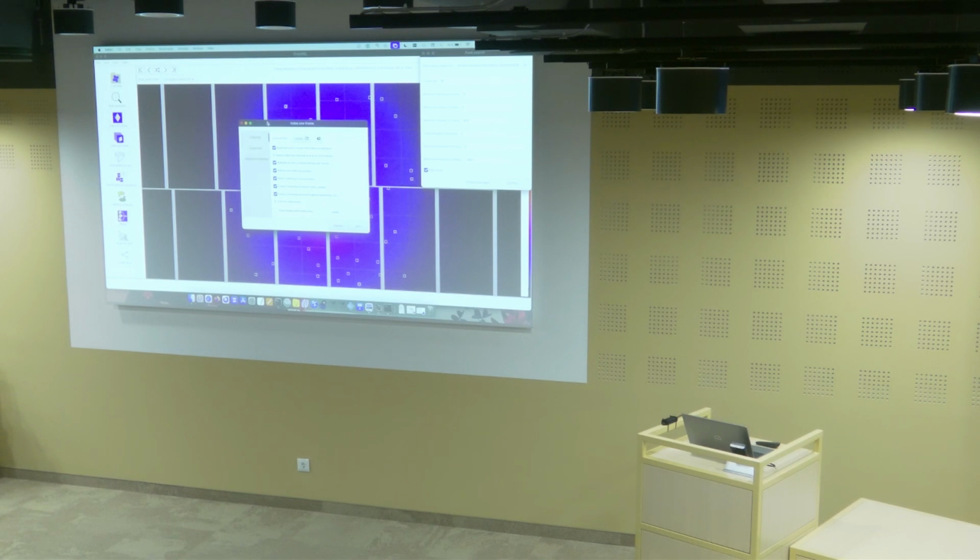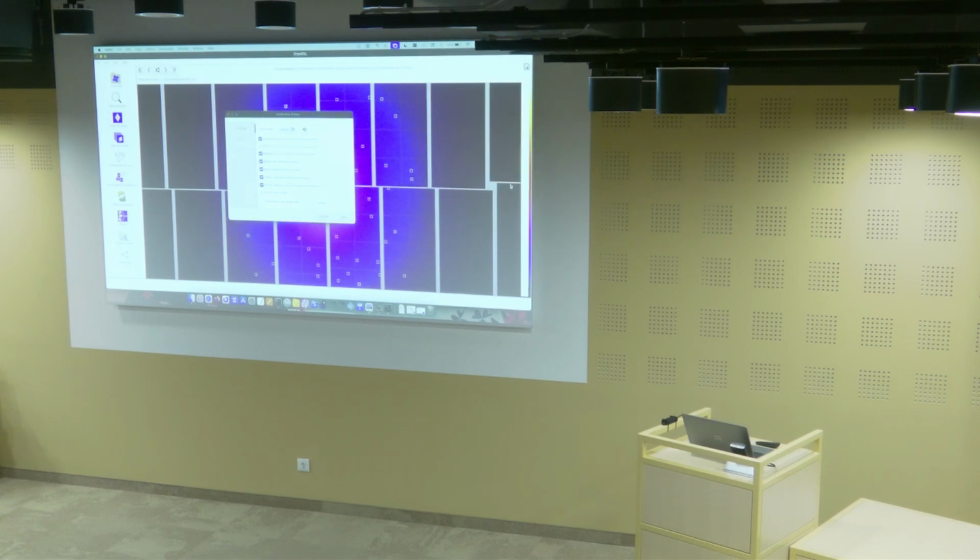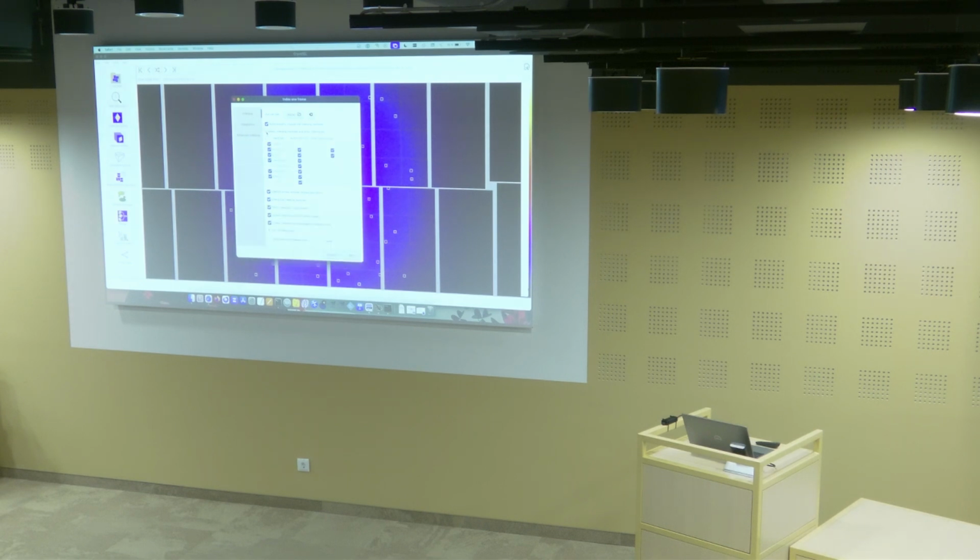So this opens up another window. Maybe I should close this first. It's going to ask us for the parameters for indexing. So indexing is really now finding the Bragg reflections on our image, given the positions of our peaks. Just to index a single image, we're not going to give it any more information about the unit cell, but later on we will give some information as well.